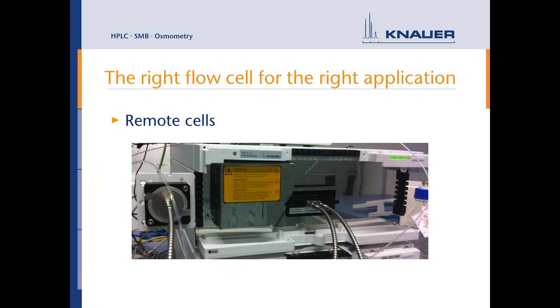So we can use this for the preparative, or also if we are interested in separating the flow cell for any reason from the device. Yeah, that's really a nice example, and thank you for the picture, because I was a little bit confused. I couldn't imagine how this adapter works, but here it becomes really clear that it's just the same cartridge used as an adapter, and with this it's connected to our flow cells.